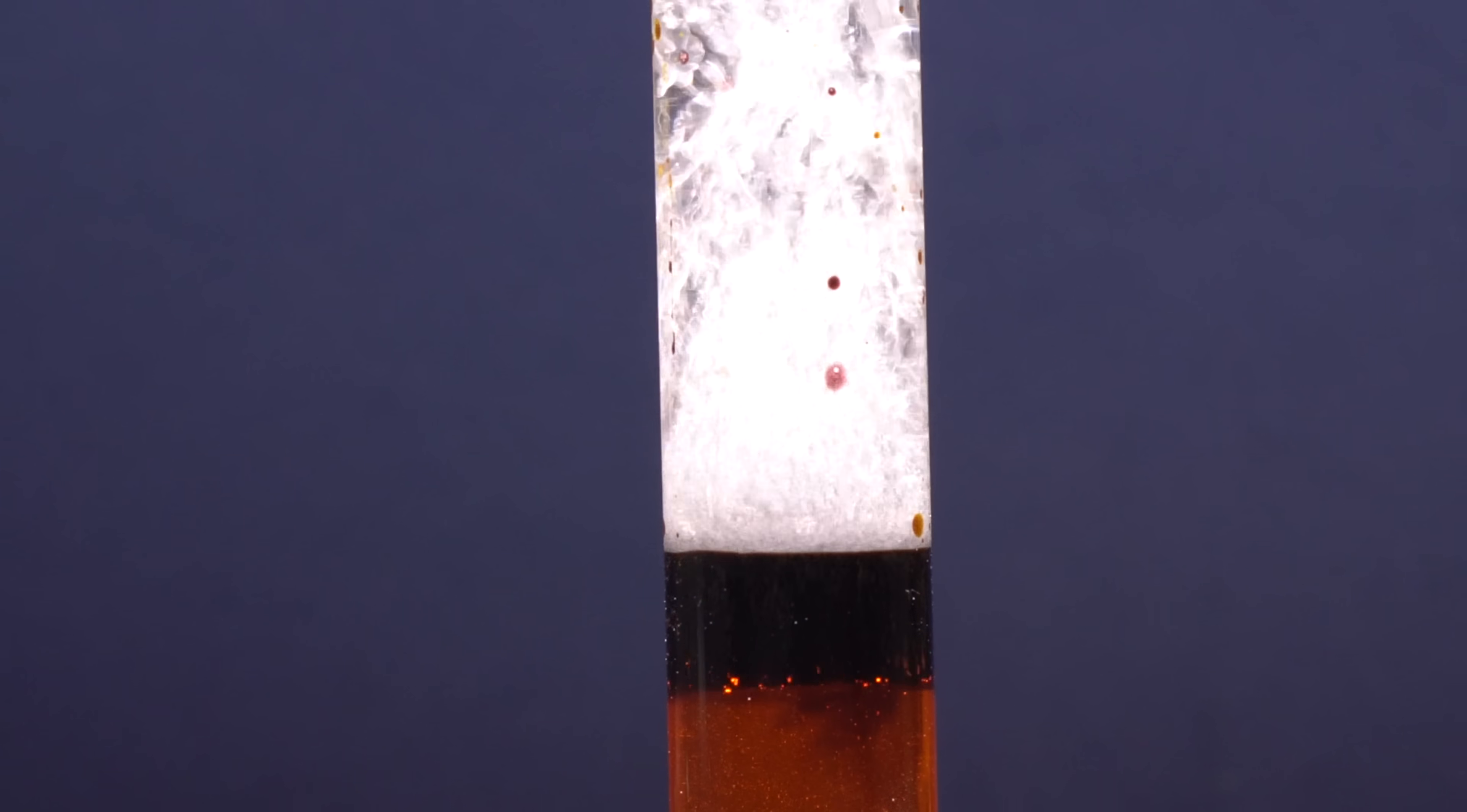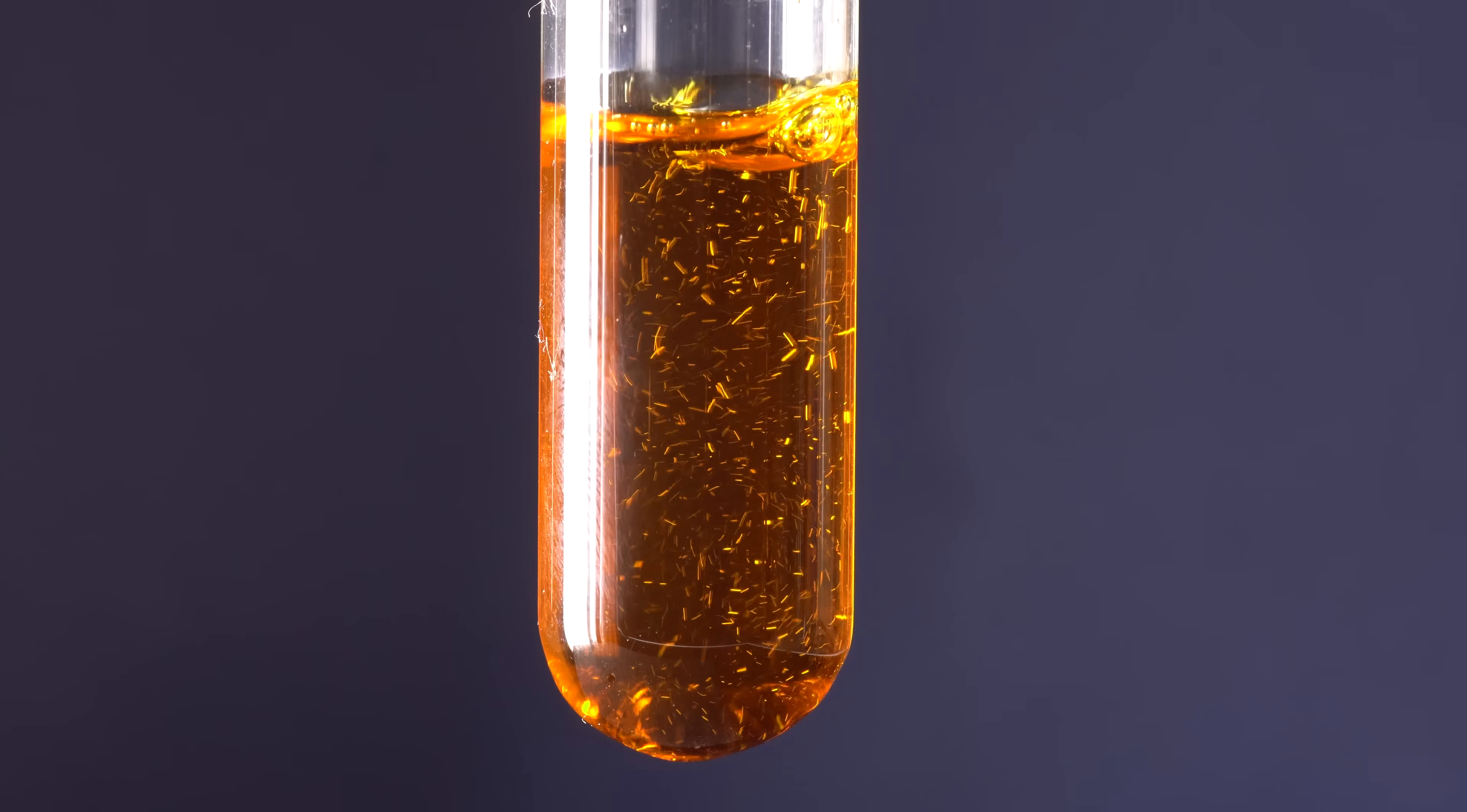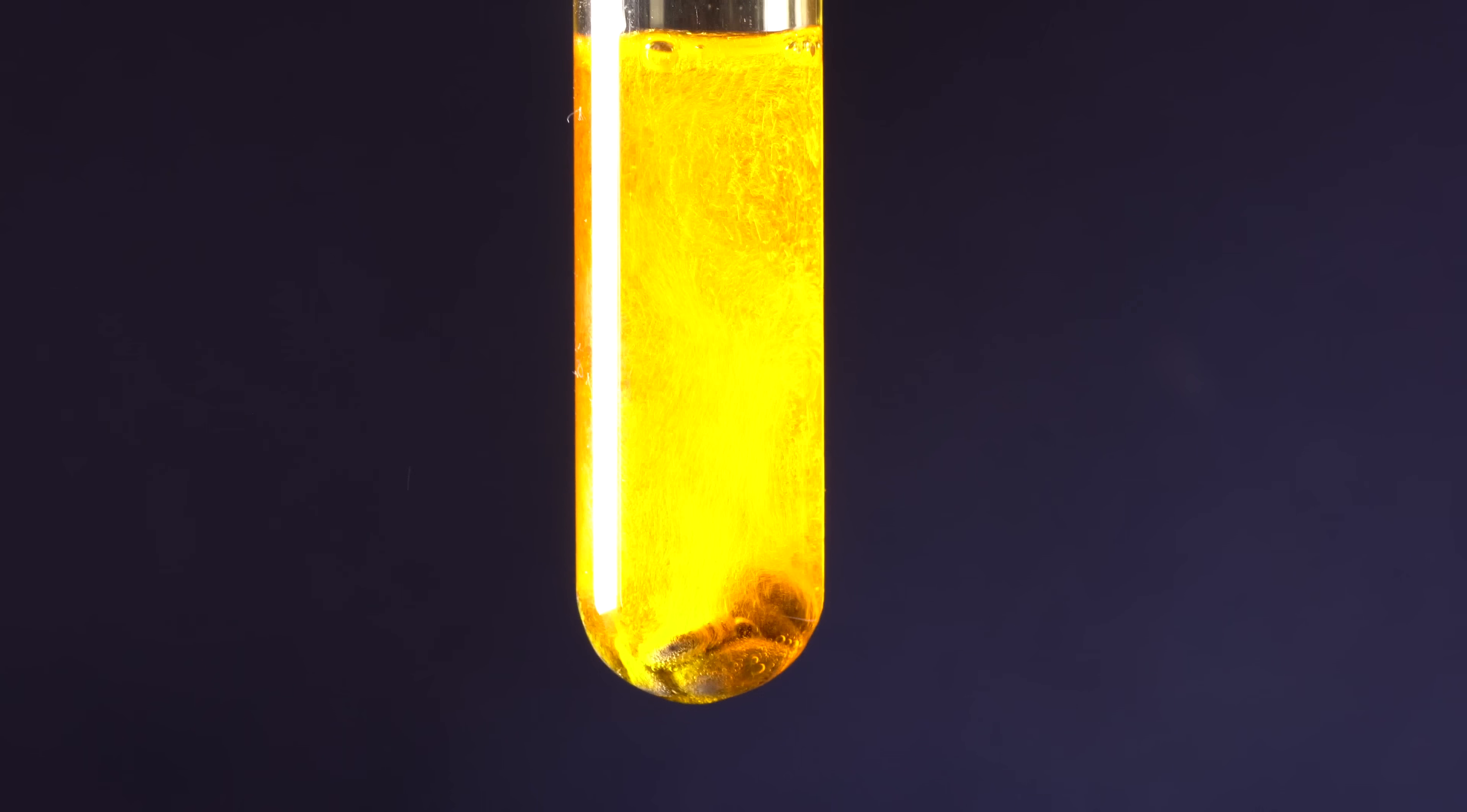In addition to the trivalent compounds, chromium can also have divalent compounds, for which we will now conduct another experiment. Let's take a test tube and pour a solution of potassium dichromate in hydrochloric acid into it. Then, we will add a few granules of zinc into the tube.